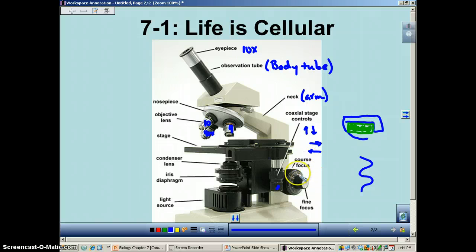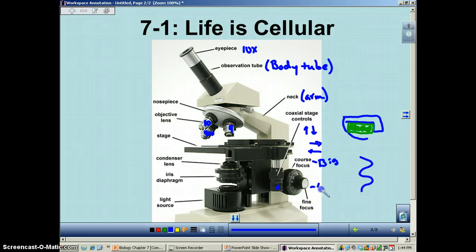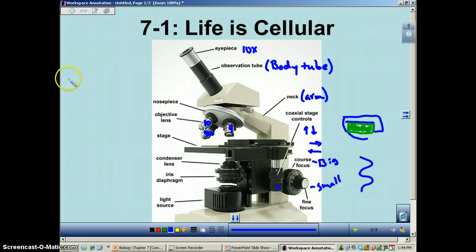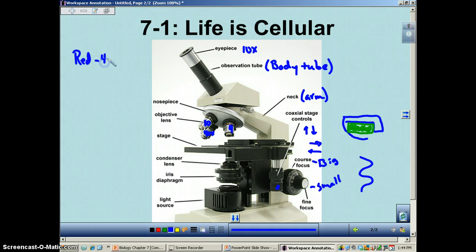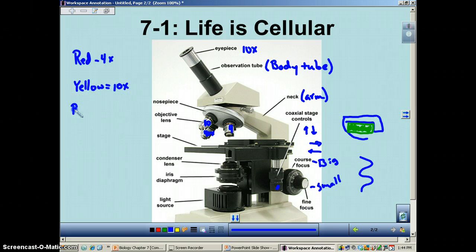How do we focus the microscope? We have two focus knobs. We have a coarse adjustment — that's the big knob — and this one will move the stage up a whole bunch. Then we have the fine focus, which is the smaller knob, and this one is used to adjust on a smaller scale. So looking at our objective lenses: the red one is 4x, the yellow one is 10x, and the blue one is 40x — low power, medium power, and high power.